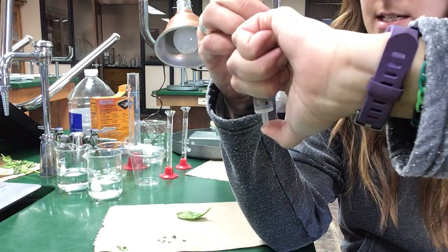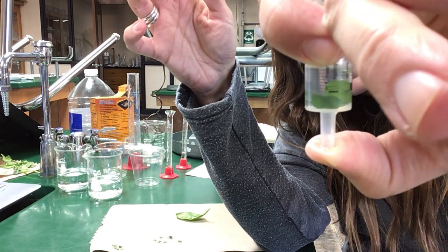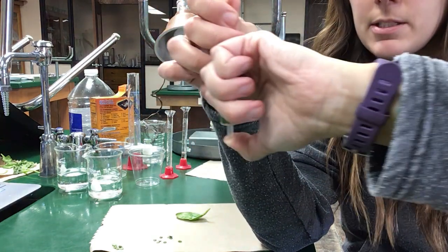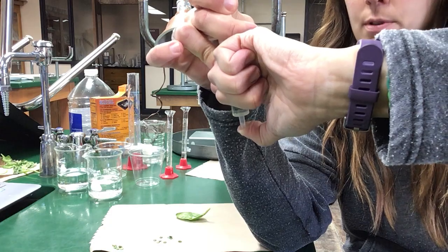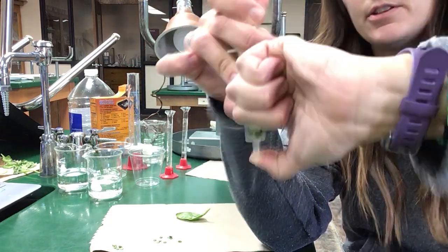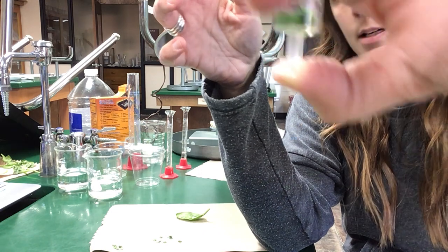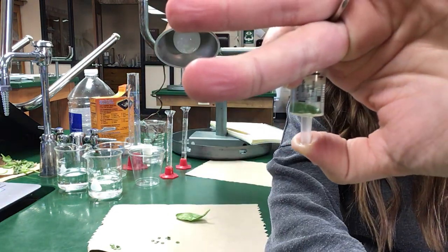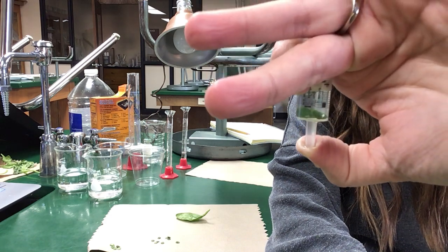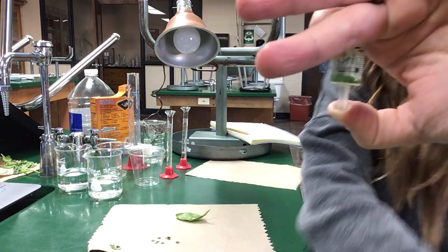So now, can you see that? All right, they're starting to sink. I'm gonna do it one more time because I already did this, and a couple started to float right away, which is okay, but we'll make sure these are really infiltrated with bicarbonate solution. Let that down. Okay, sorry, my hands get in the way. Perfect. Now instead of floating, all of those are sinking to the bottom. That means they have been infiltrated with that bicarbonate solution.